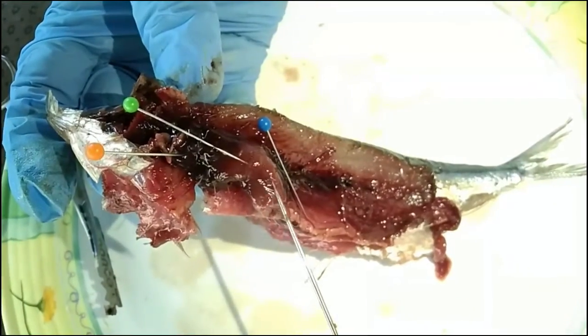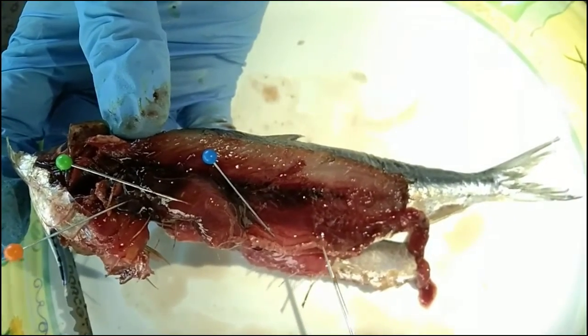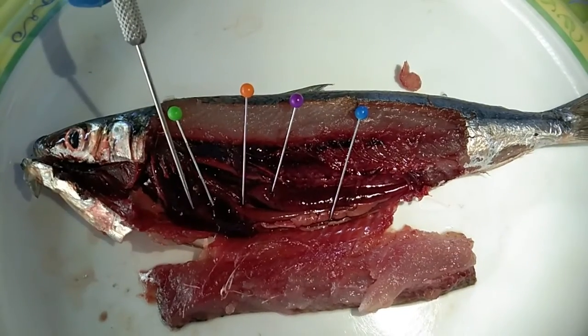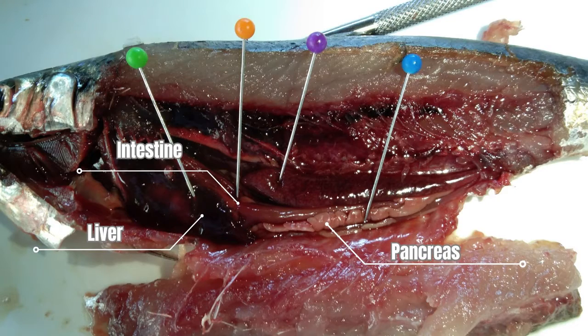Starting with the digestive system, the organ with the green pin is the stomach and the organ with the blue pin is the intestine. This is the intestine, the liver, and the pancreas. In the fish digestive organ, the stomach is responsible for digesting food. In many fish, the food is processed in finger-shaped pouches called pyloric seca, which secrete digestive enzymes and absorb nutrients.